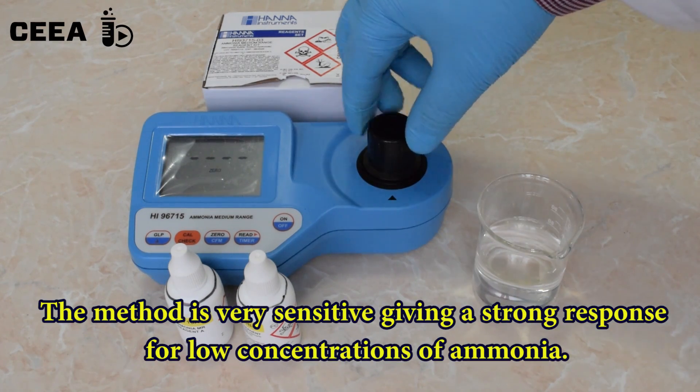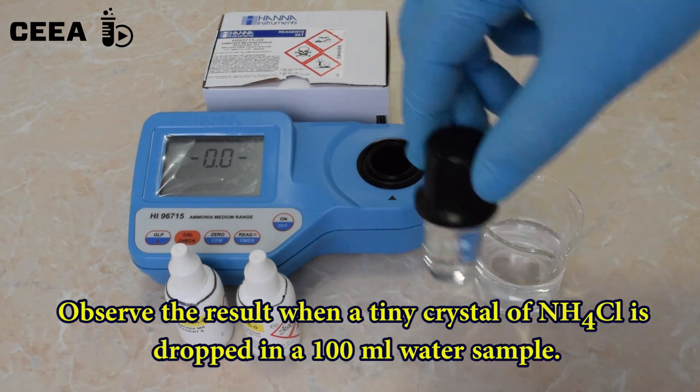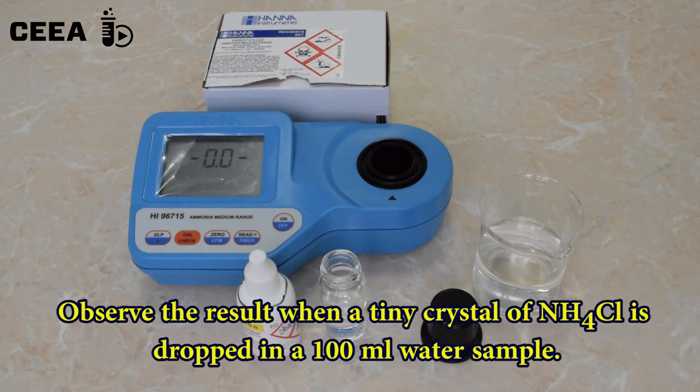The method is very sensitive. A tiny crystal of ammonium chloride is dropped in a glass of water and the sample is analyzed.